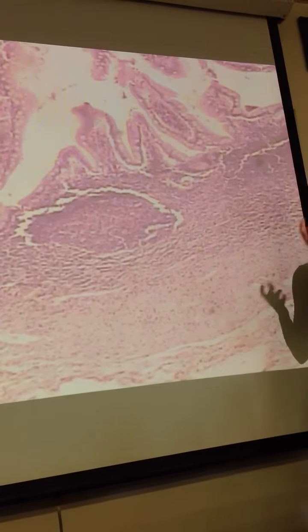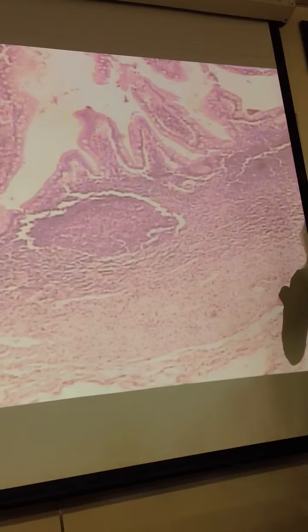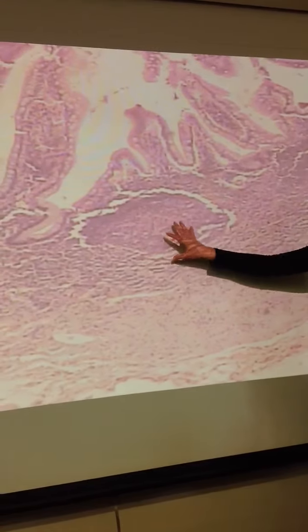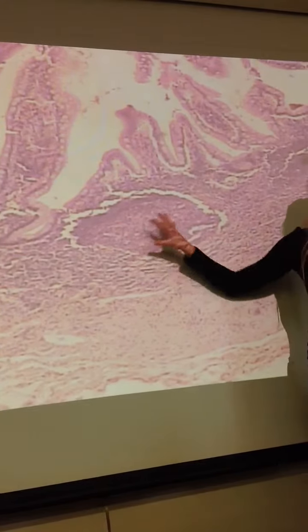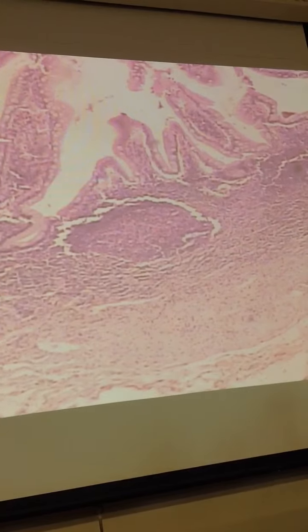It wasn't even that it was a color change. It was that that area was darker in color, right? You had a more dense grouping of matter. That's what we see here at the Peyer's patches. It's just that denser group. I'm going to show you another one that looks a little less clear just for the sake of comparison.